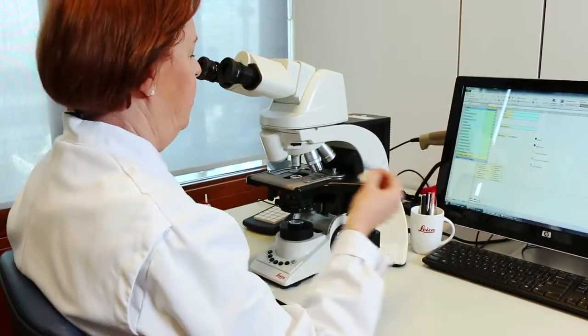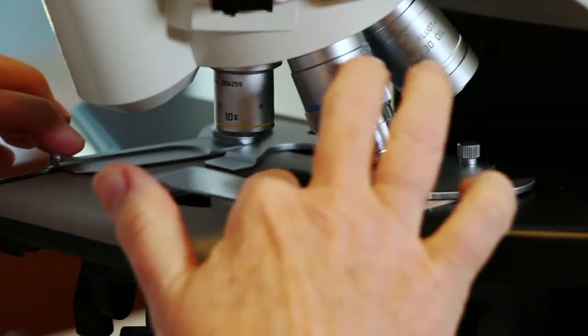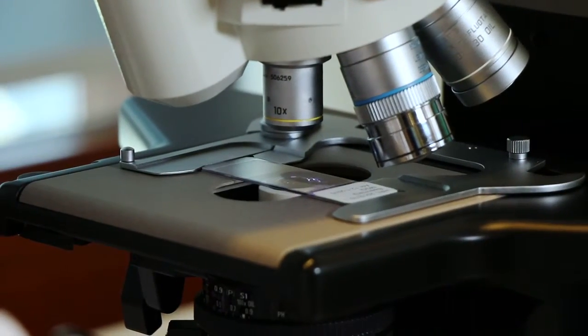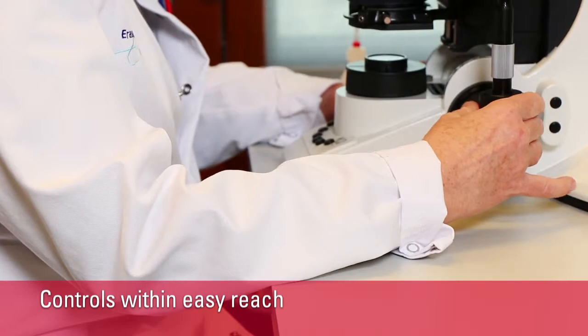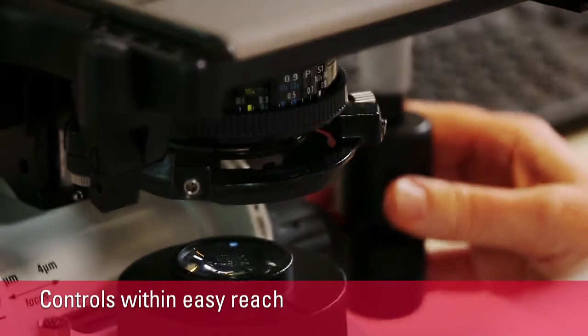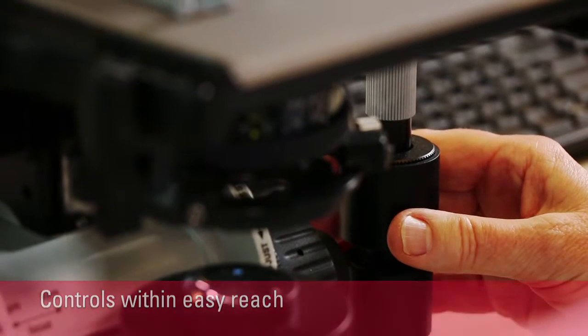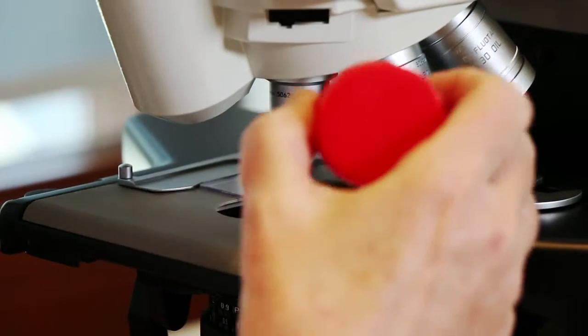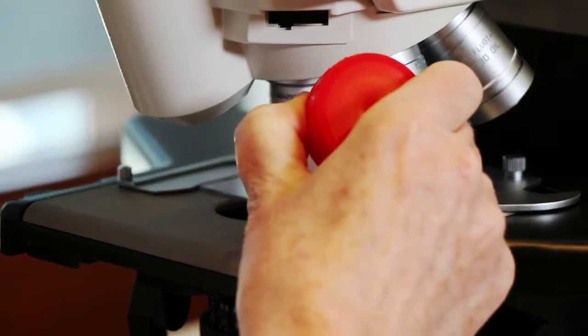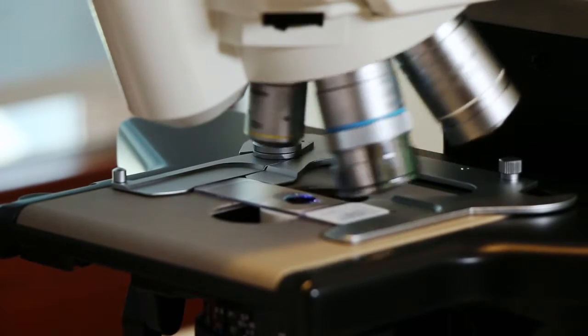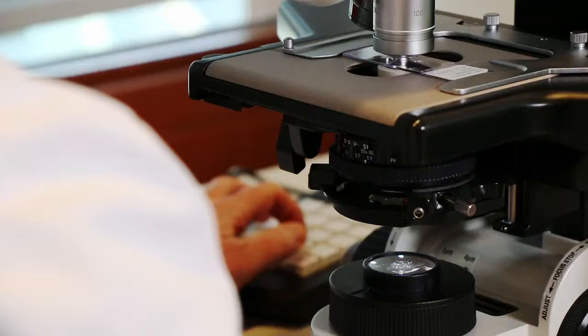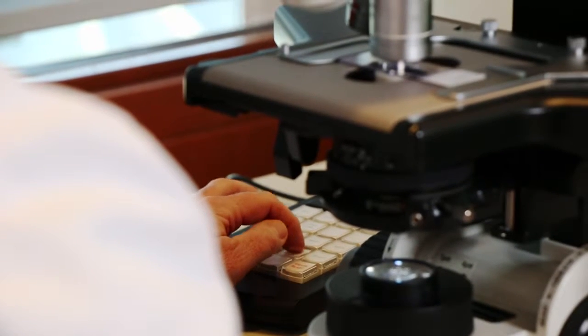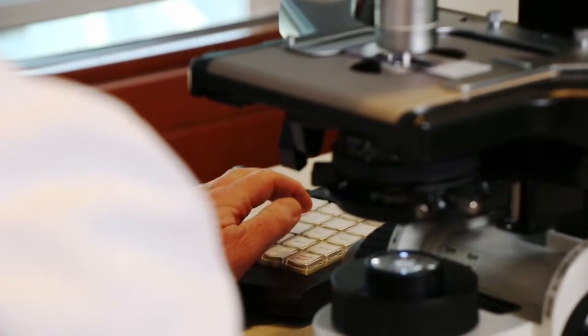I can use my right hand and also move the table together. I examine the slide, also make a count again and make a report of it.